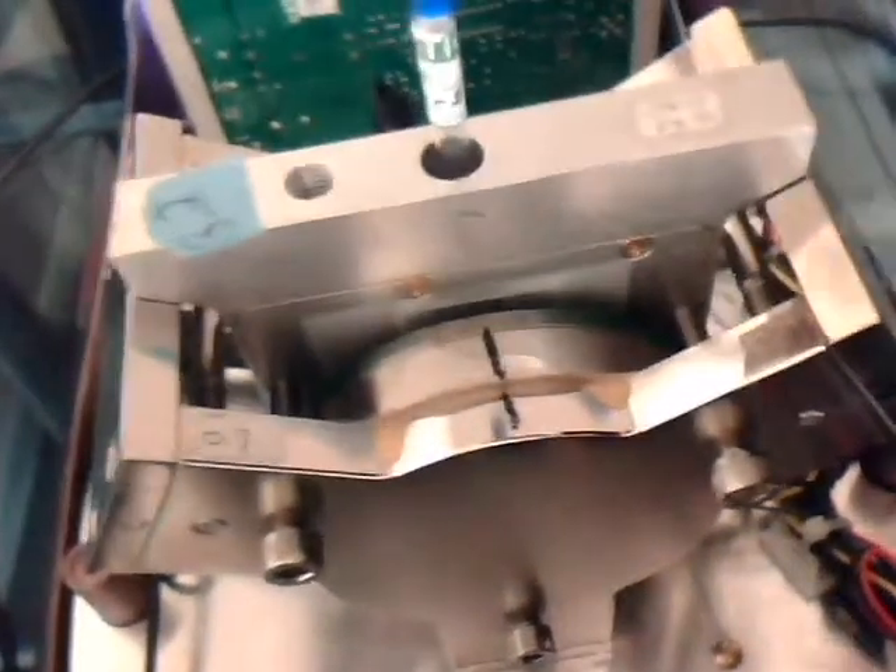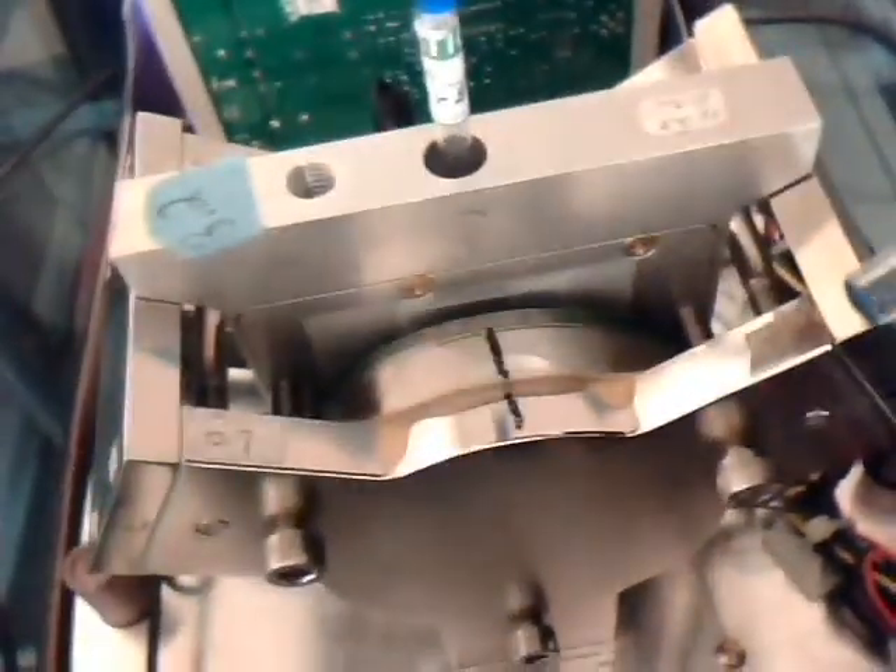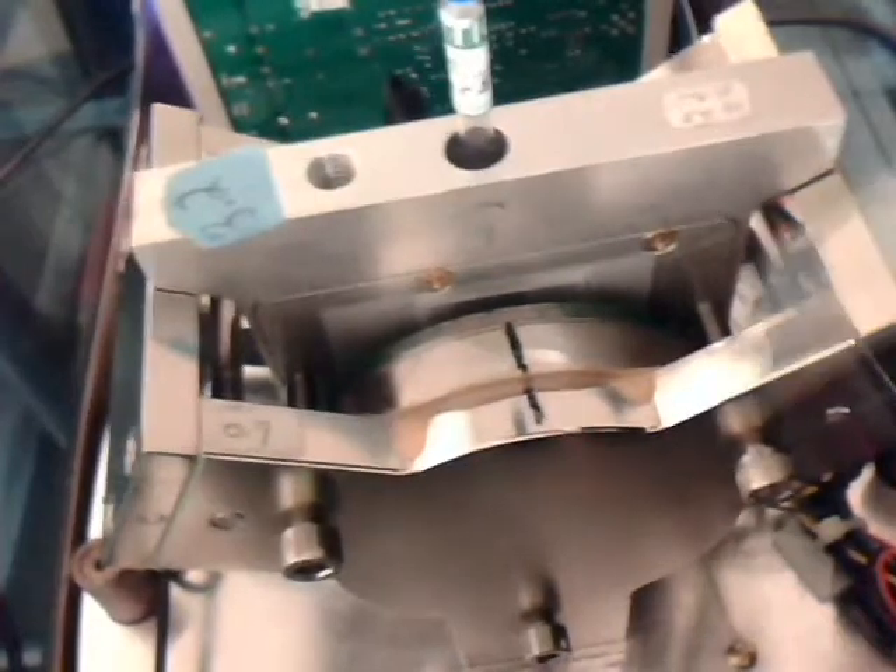This is a view of the yoke assembly from the back of the instrument. On the back, you don't have any magnetic field adjusting screws — you just have the three cassette locating screws.